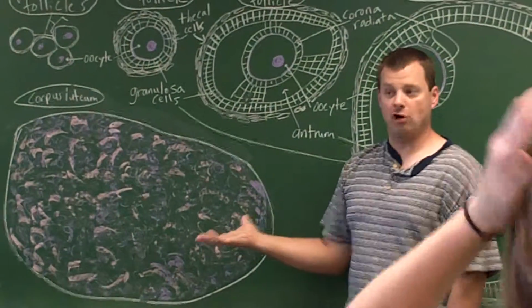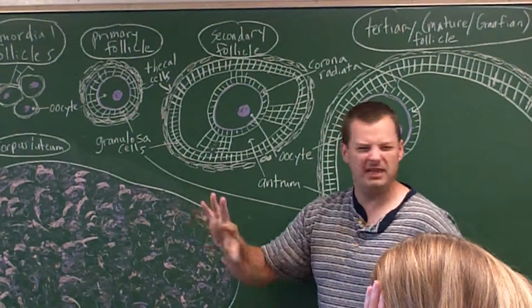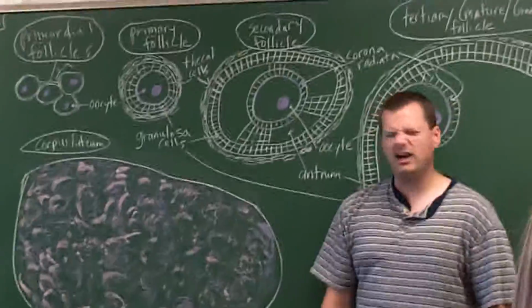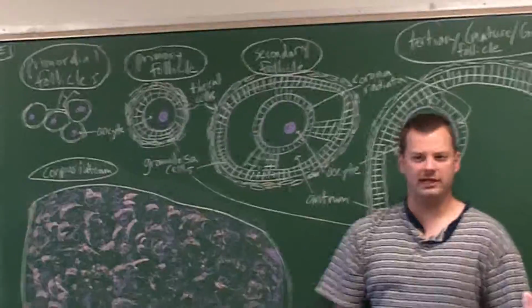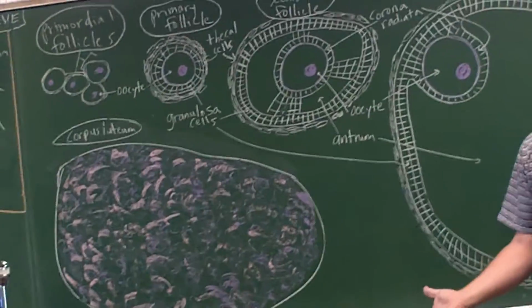It's hard for me to draw with chalk because it just looks kind of all mottled and multicolored. There's kind of pinks and purples all mixed together. It looks very dotty, with lots of dots from the nuclei of the glandular cells. And it's huge. It's huge. I cannot give it true justice here. I ran out of room, to be honest with you.